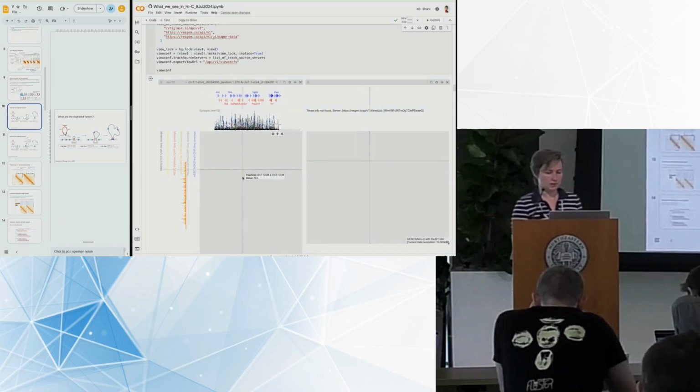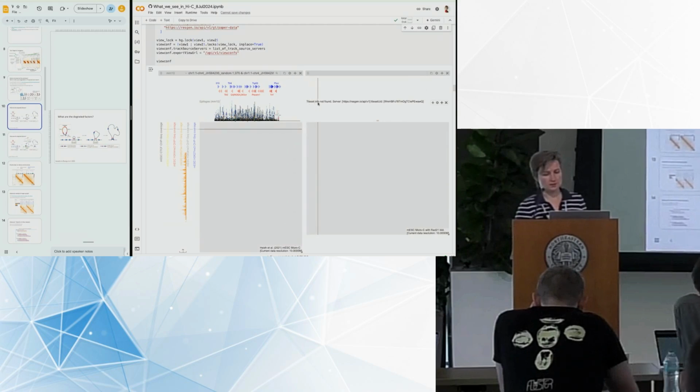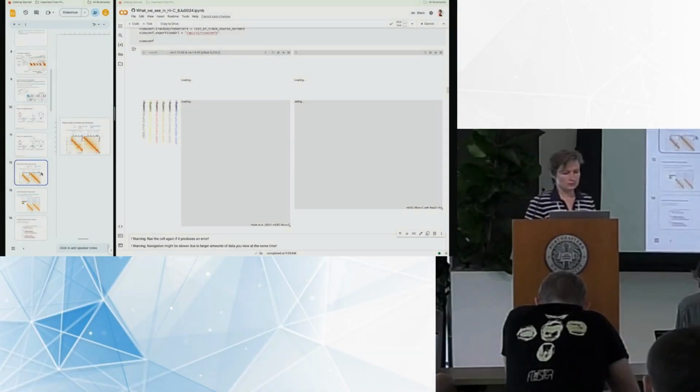So please take your time while this view is loading. In my case, I see this trouble: tile set info not found. If you encounter the same issue, please just run the same cell again, and it should resolve it. Meanwhile, I do not know whether it will be fine for Google Colab because we are all logged in.